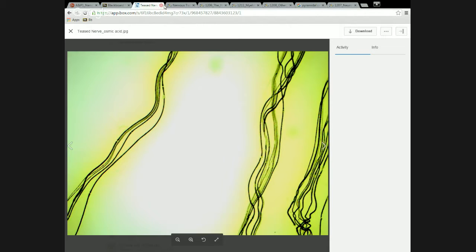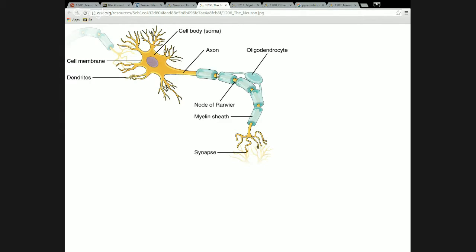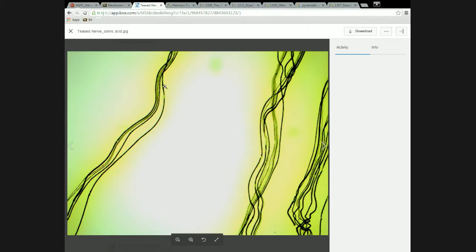So in the drawing from the textbook, they look pretty short. But really, if it was drawn to scale, one myelin sheath would go off the screen. Okay. The gaps are that far apart. If there were so many little myelin sheaths that they were that close together, they wouldn't be very functional. They have to have widespread gaps, which increases the speed that the signal travels along the axon. Okay, so I just want to point out, in real life, that's how far apart they are.